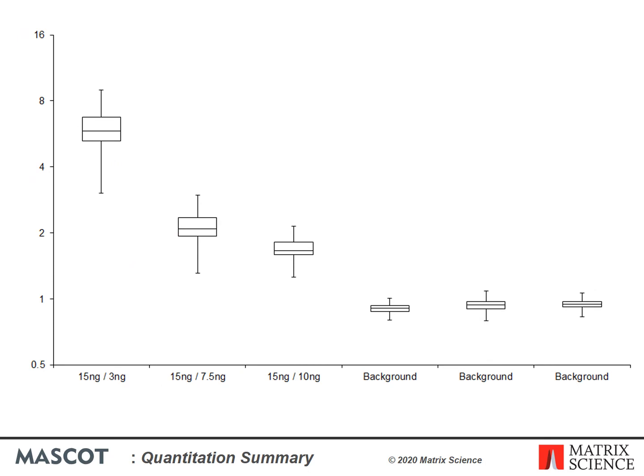Sometimes you may be able to get the report you want direct from Excel. For example, this box and whisker plot of the data was produced directly in Excel.